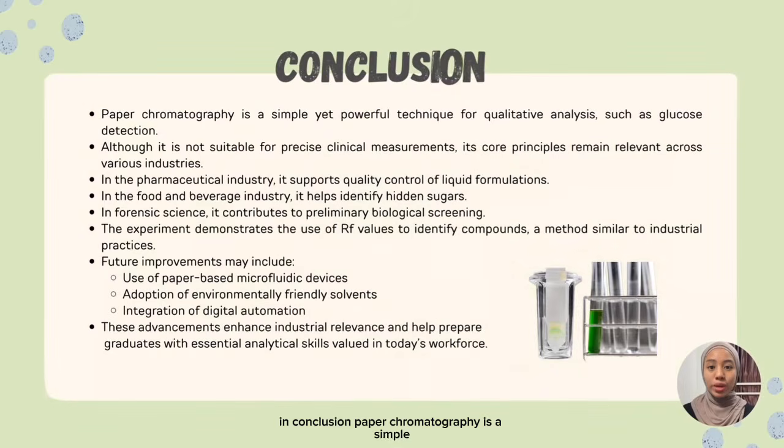In conclusion, paper chromatography is a simple yet powerful technique for qualitative analysis such as glucose detection. Although it is not suitable for precise clinical measurement, its core principle remains relevant across various industries.